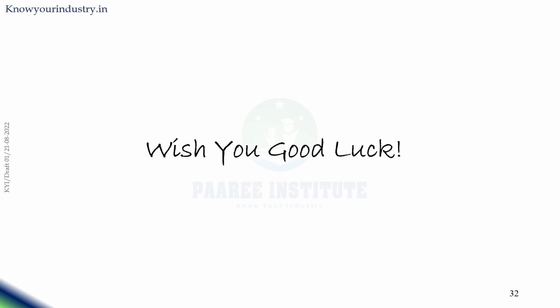Then the equipment generally available in the instrumentation lab, where the analysis will be done after the sample is processed in the wet lab. And also we have seen how the waste generated from the laboratory is managed by different procedures, which are explained in this module. And finally we have seen the government approvals required for running an analytical laboratory. Thank you.